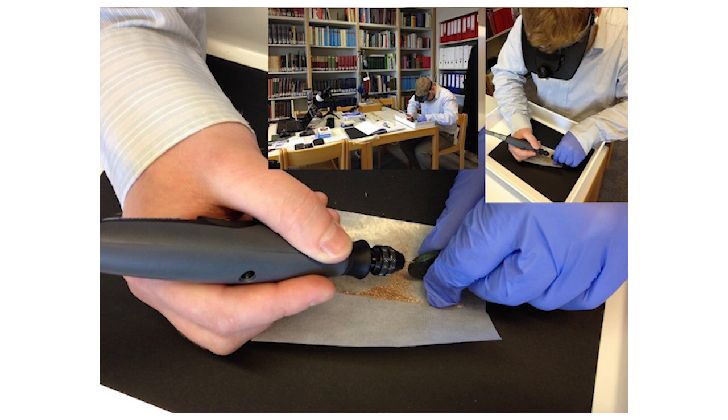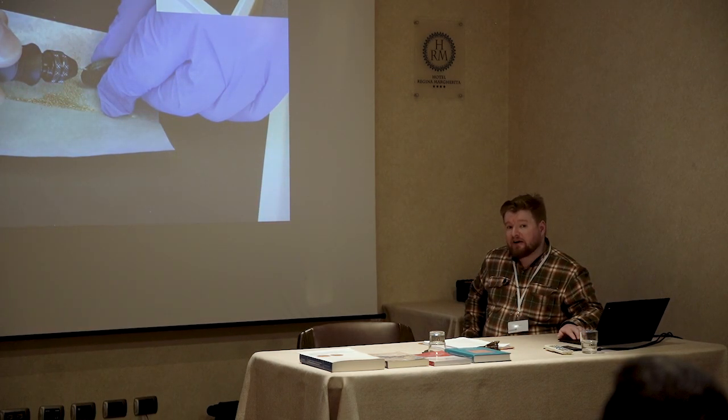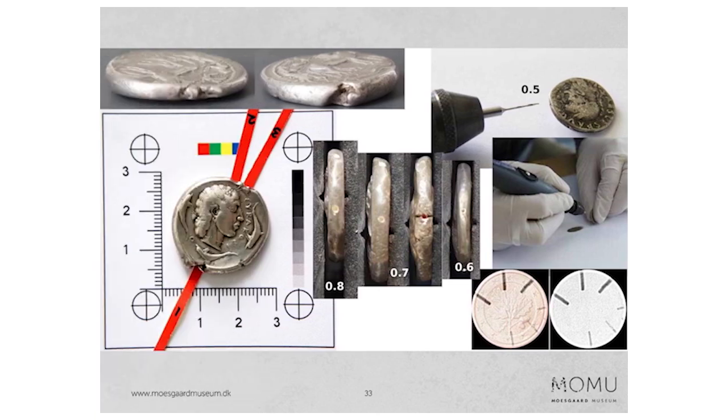That's what we would analyze for isotopes to see where the metal may come from, and also for the metal composition to see how fine it is, to see if there are any characteristics that help us identify mixing or where it comes from. And we go down to less than 0.5 millimeter. Some people do even less. So we target different places.